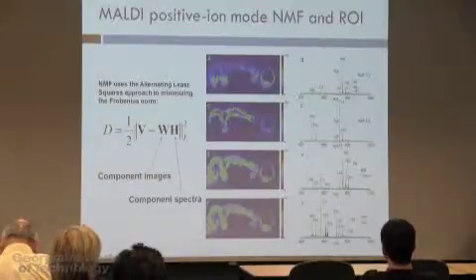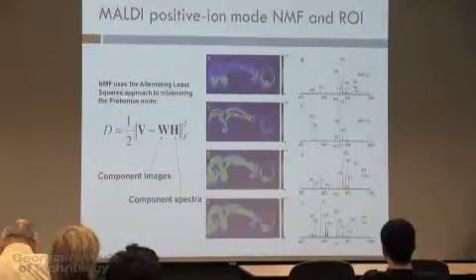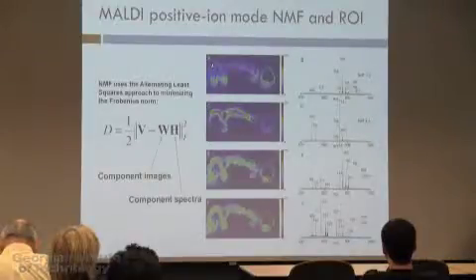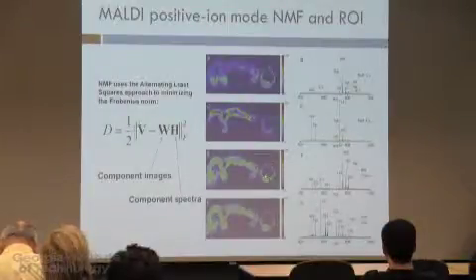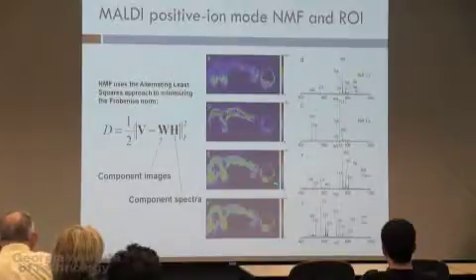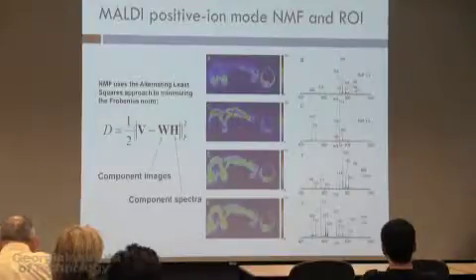Things seem to be changing in many parts, which goes back to the theory that maybe things don't necessarily originate just in the ovary. Maybe there are some microlesions that are migrating to the ovaries, and that's what's contributing to the development of ovarian cancer. These types of images are called component images because they really combine several ions at the same time. But you can also do just a region of interest image, where you select this part of the data and say, okay, show me all the ions that are here. So all these ions in this particular tumor region are shown in this mass spectrum, and you go through the same identification process I was telling you before.